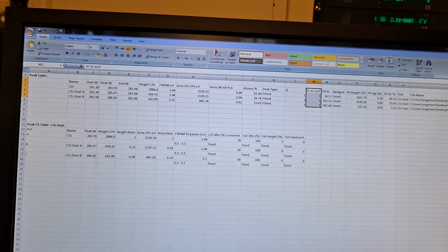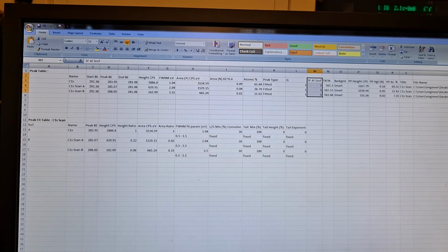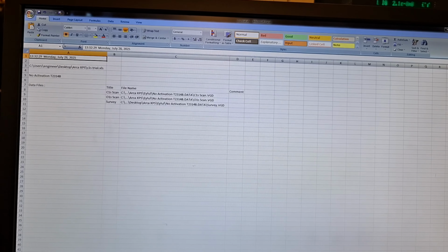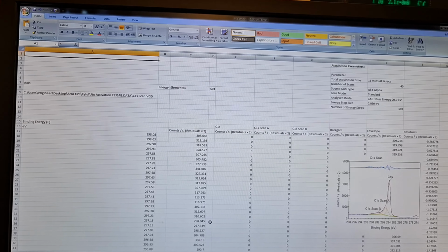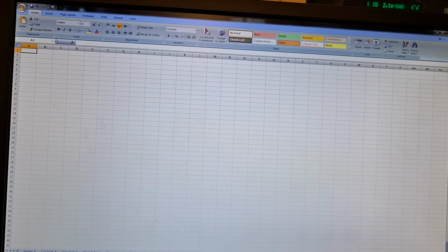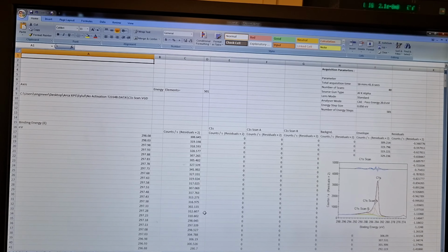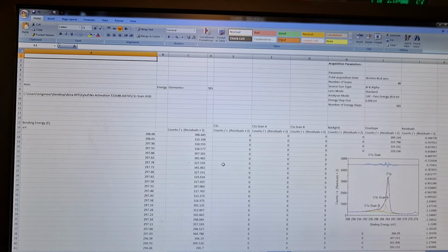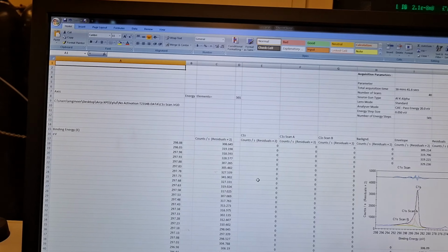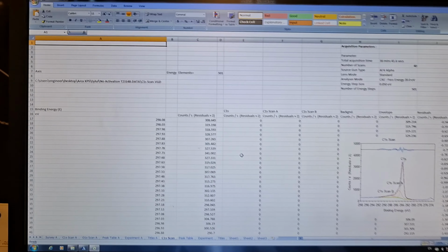So if I use the oxygen 1s, then this ratio shouldn't be 1, of course. And there are also other useful informations. These are empty files simply, but data files are something like this. So I can draw this data in another graphing software, and this is it.